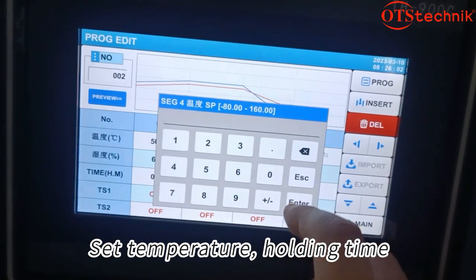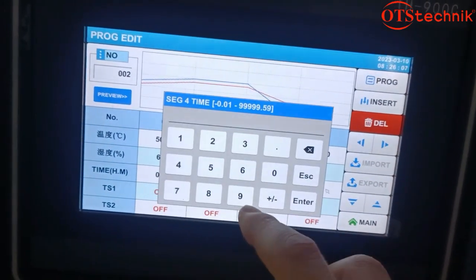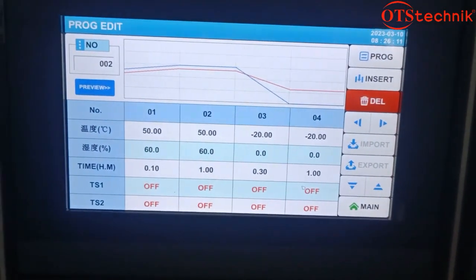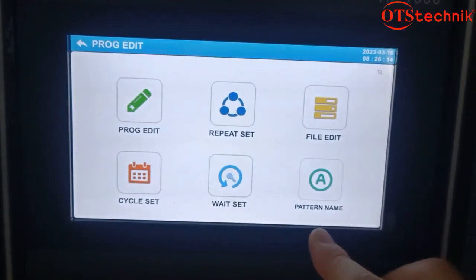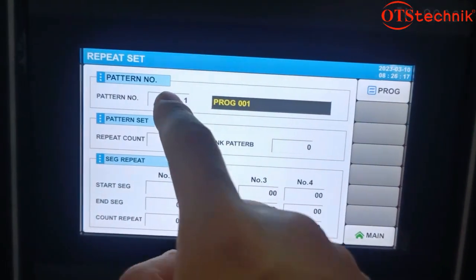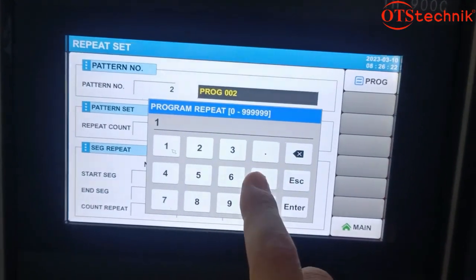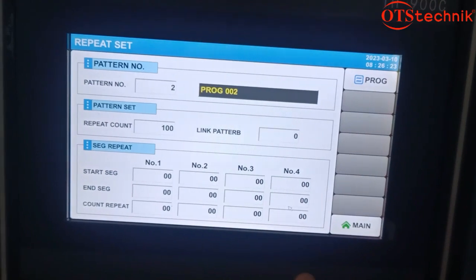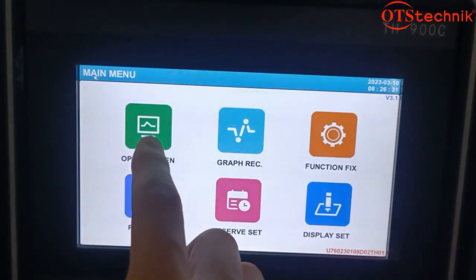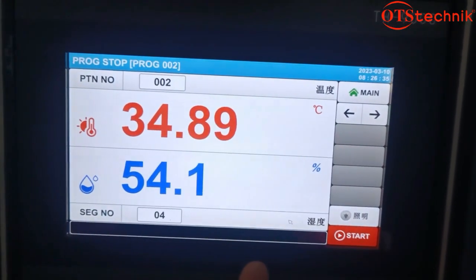Set the temperature and holding time. Set the test cycle. Then select the program serial number to start the test.